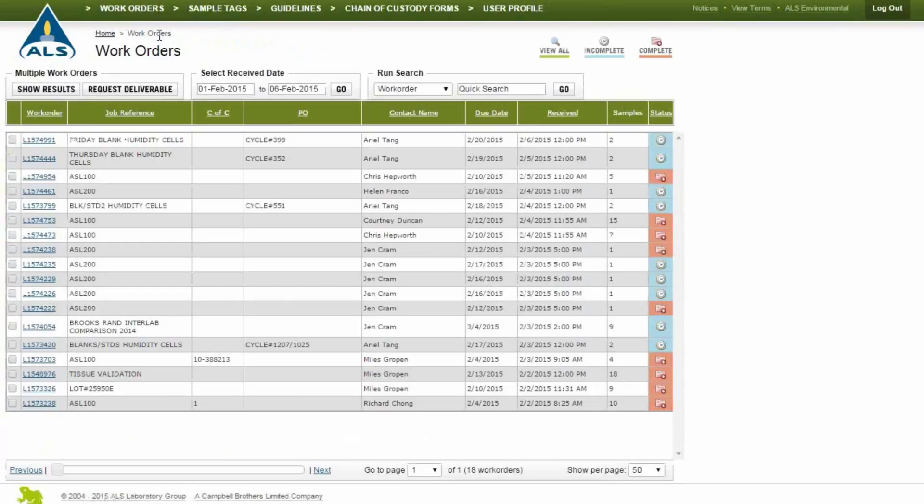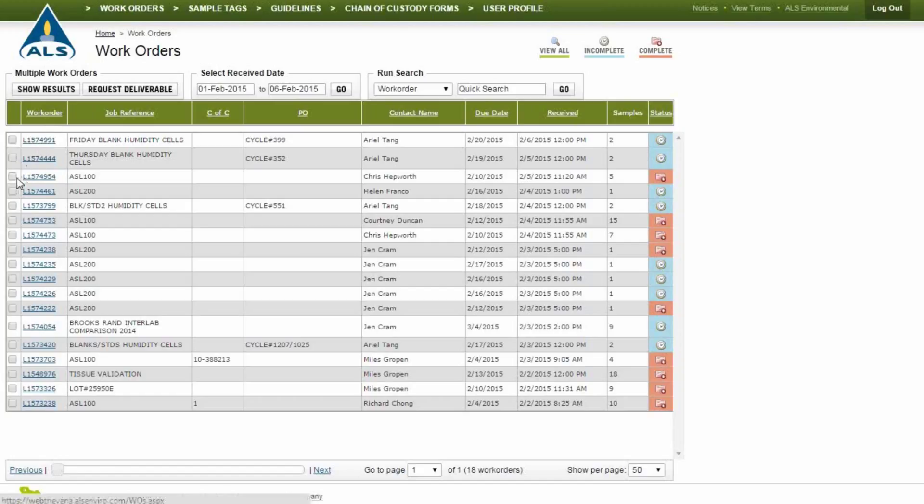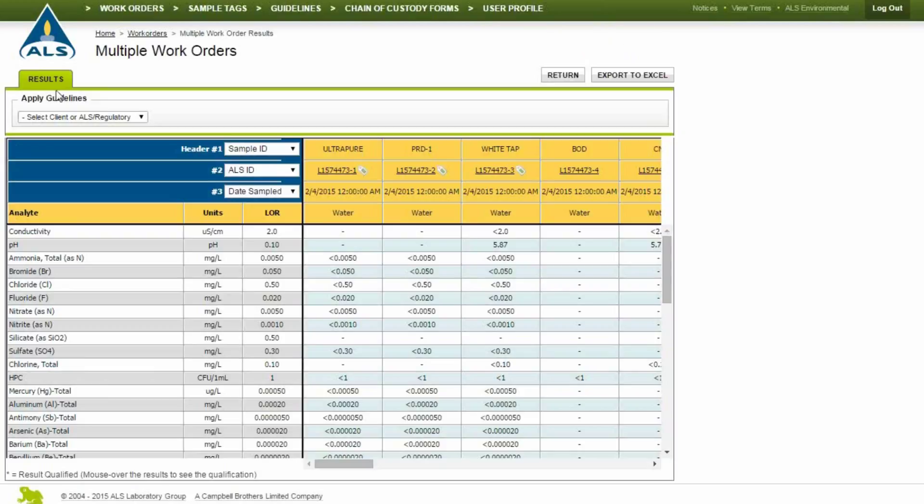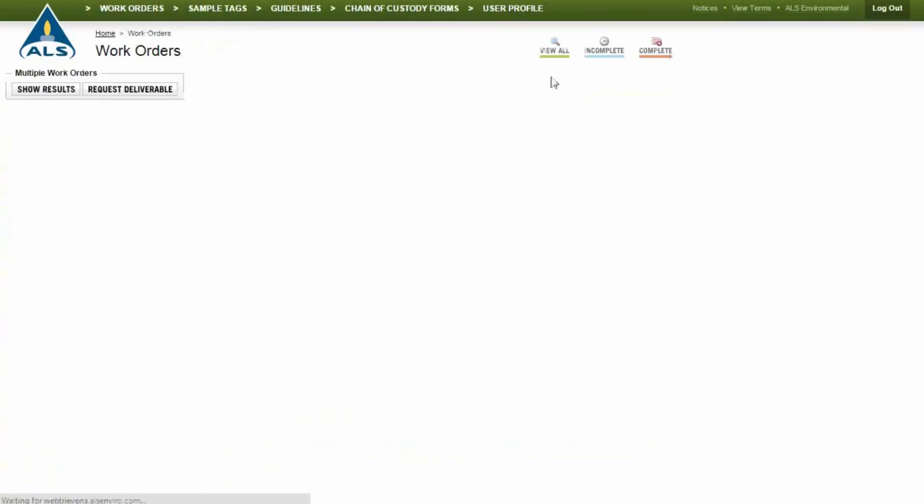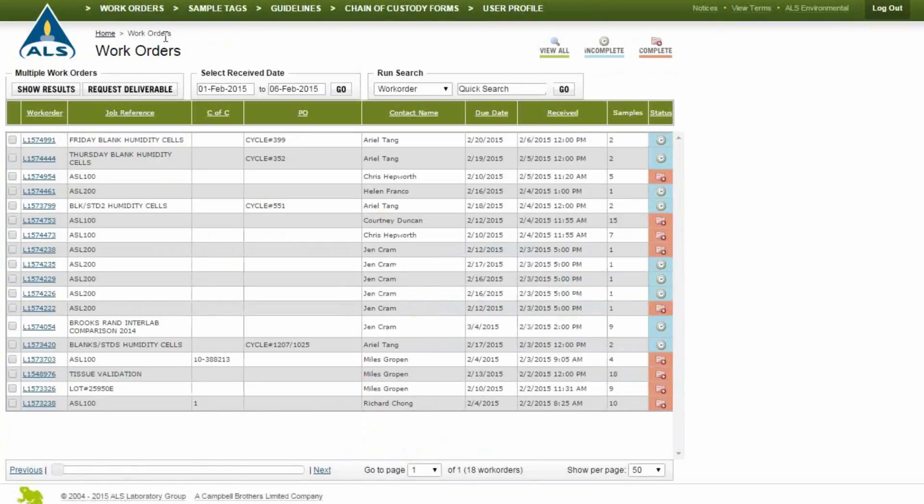To view and compare multiple work orders on one screen, check the boxes next to the desired work orders and click Show Results. Export the compiled work orders to a spreadsheet by clicking Export to Excel. Click Return to go back to the default home screen.